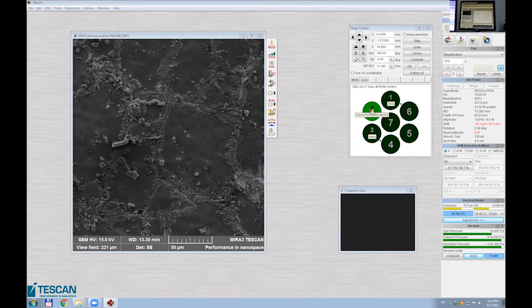So you see these grain boundaries are poor in titanium, for example. And you have a bigger and bigger peak of copper here. So you can compare not only by mapping but also by line scanning.